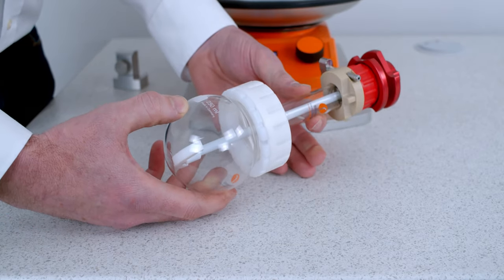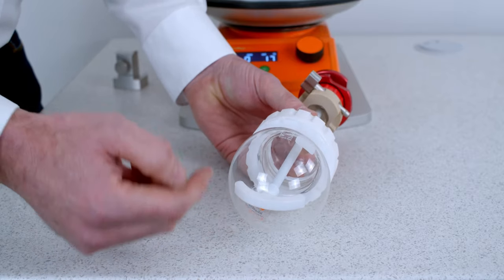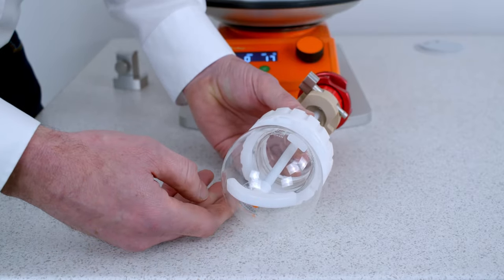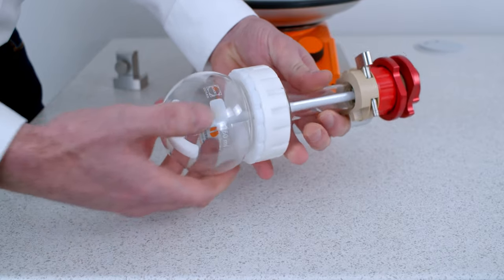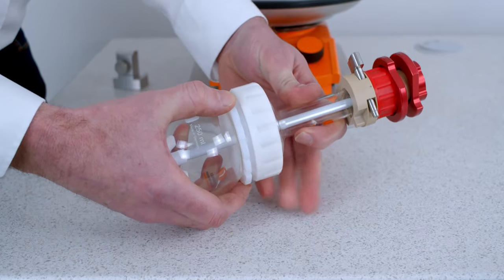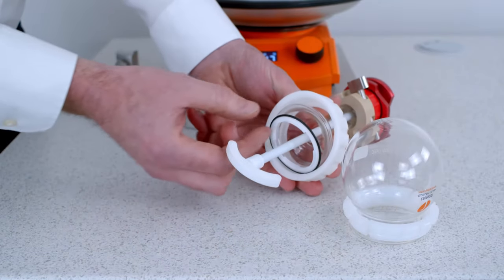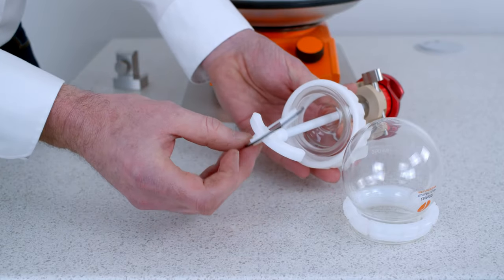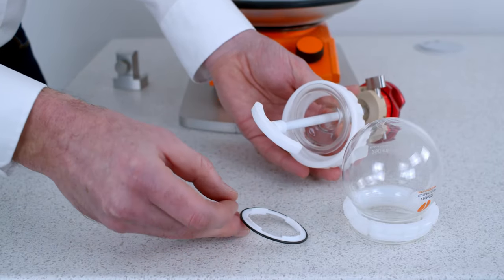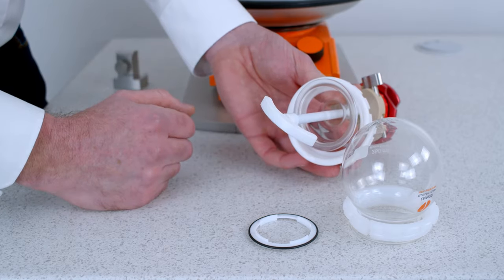Let's take a look at the wide neck flask. These are often our most popular choice because it allows you to get in a proper anchor or turbine stirrer. First of all you unscrew the flask coupling — this just holds the reflux tube at the top to the flask. You can see here we've got a PTFE collar that supports the o-ring, which is held between two flat surfaces so you get a good seal.